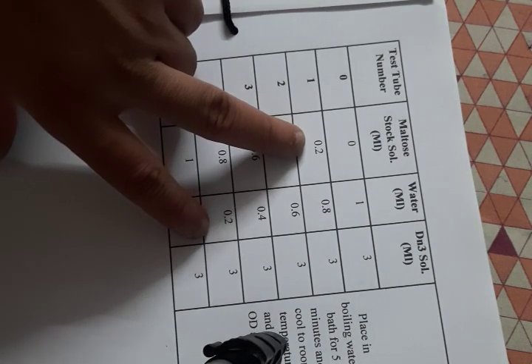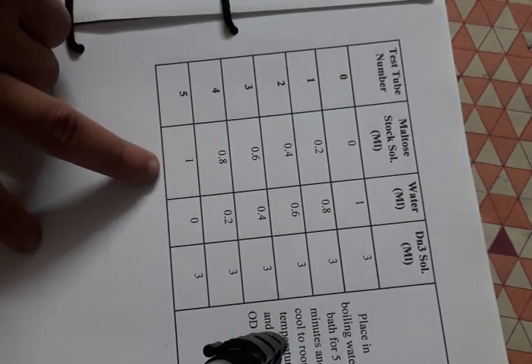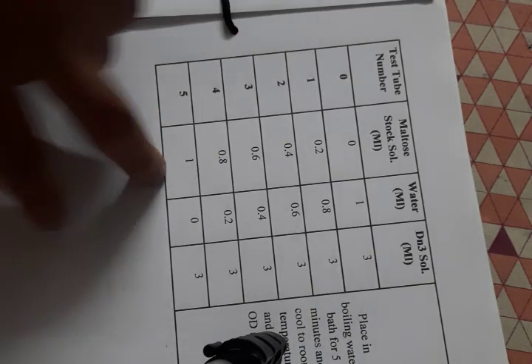Here, see out here. So here is 0, so this is going to be the blank, and then there is 0.2, and the total volume is 1. So this is a 20% solution of maltose, this is 40%, 60%, 80%, and this is the 100%, to create the standard curve. And this is the standard curve.